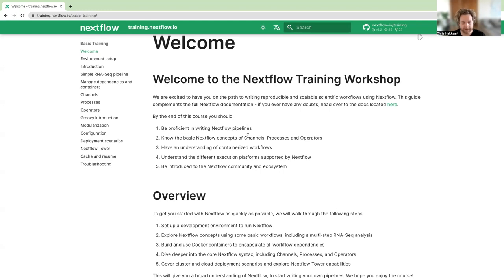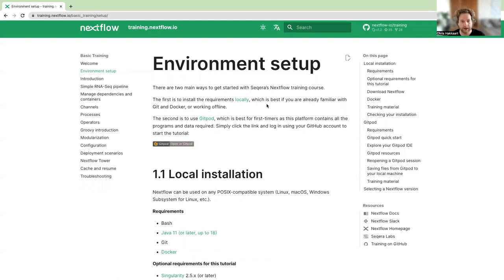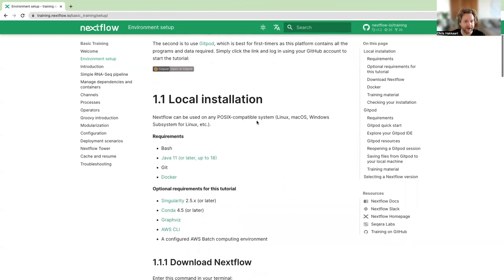First, we need to set up an environment so you can follow along with the coding. On the left, we have environment setup. This page has instructions for installing everything you need either locally or through Gitpod. I do really recommend that you use Gitpod — it's a free virtual environment you can use for up to 50 hours per month, and it has everything already installed, including the data, scripts, and all the tooling. If you want to install locally, the requirements are Bash, Java, Git, and Docker.